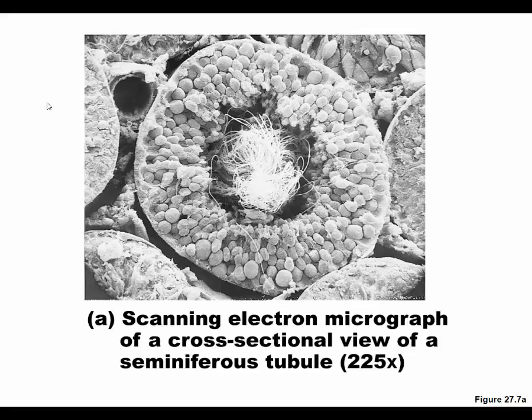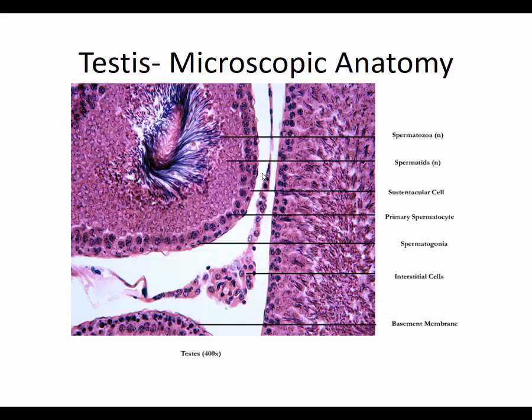So out here at the very edge is where you would find the germ cells that are diploid, that are destined to become sperm. As sperm develop, they work their way inward inside this tubule until they break free and with their tails swim away. Then they enter the vas deferens, and out and enter the female and fertilize the egg.